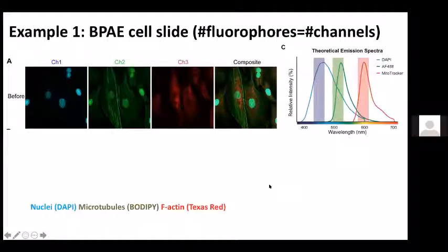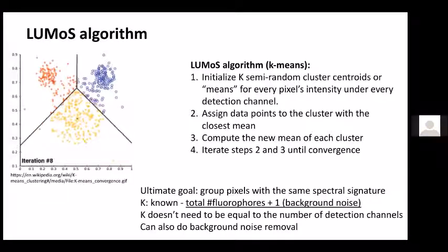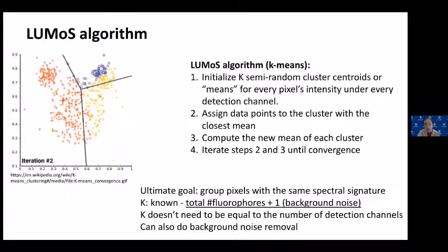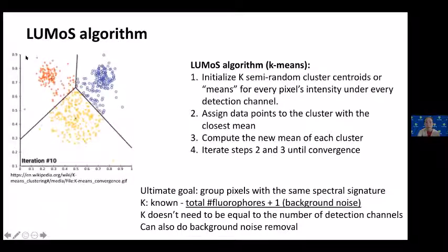I had a question. Sure. You talked about a profile, and I'm not quite sure how many spectral records you are working with here in order to derive your profile. Your profile is based on clusters of pixels, so can you describe that? That seems like a key. I was thinking of analogies with detection in color space, for example, visual. So you mean how many different detection channels we have? Yes, that would be helpful.